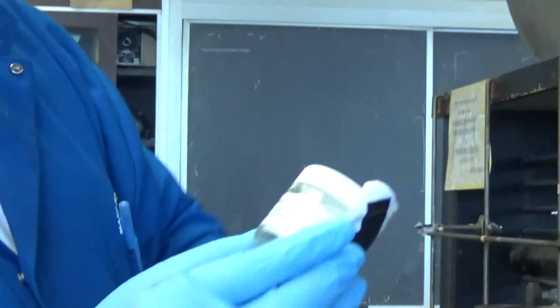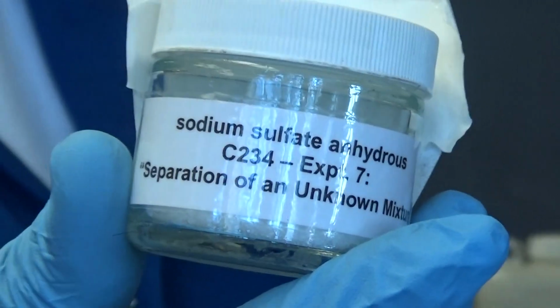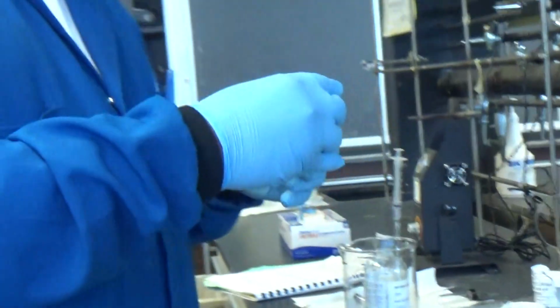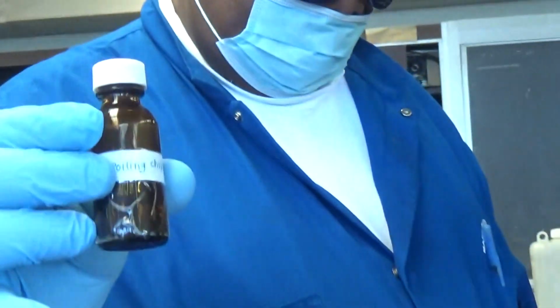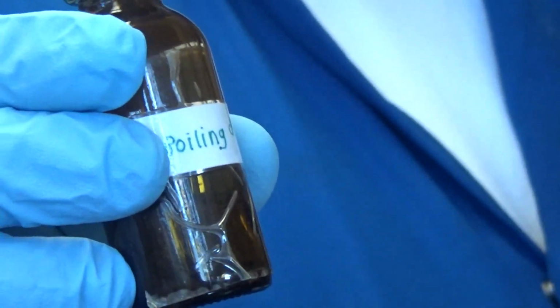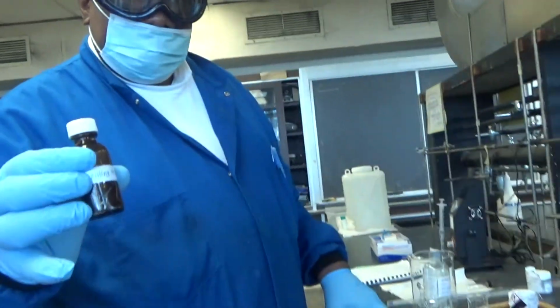We're also going to need a drying agent. In this case, that will be anhydrous sodium sulfate, as a drying agent for the aqueous workup that we'll be doing. We are going to need some boiling chips too. Those are the little ceramic things that prevent bumping during boiling, so it boils nicely.